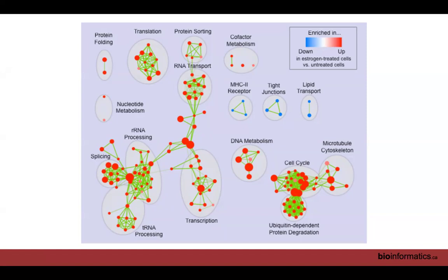Firstly, I just want to comment on the fact that this network was made a long time ago. It was one of the original papers of the enrichment map, when we developed it, and all of these annotations were done manually. Basically, someone came in, looked at each one of these sets of pathways that are coming up and attributed a thematic phrase associated with that cluster. We already know from network analysis that finding clusters is something we can do within the network software. Each one of these clusters is computed as nodes that are highly interconnected.